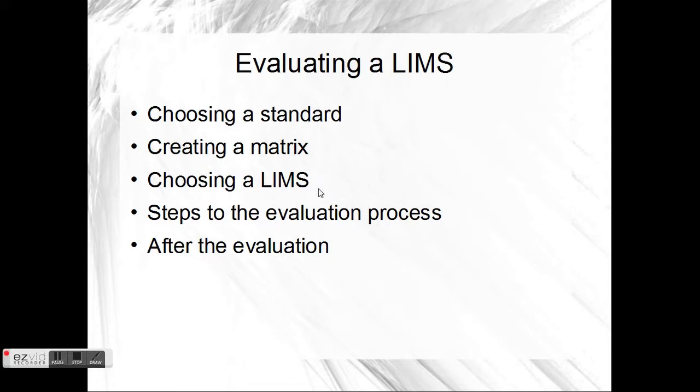Choosing a LIMS, I really like to do FOSS evaluations whenever possible. That's free and open source software. Sometimes it's referred to as free or open source software. I really think that the FOSS community is very underrated, and they make some really great products. So I have chosen an open source LIMS for my first evaluation, and I hope to continue to do that. But those of you with proprietary LIMS, I'd be happy to evaluate yours as well if you so desire.